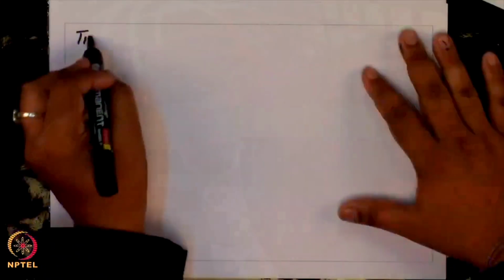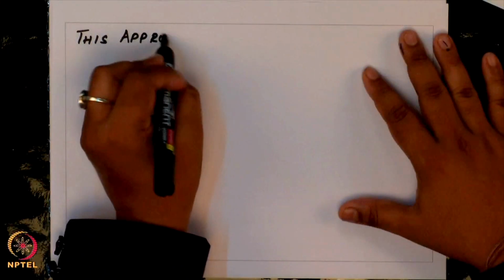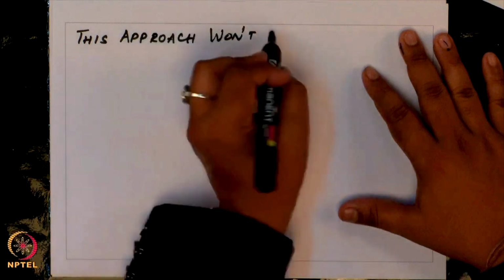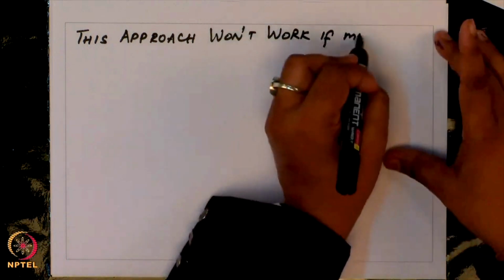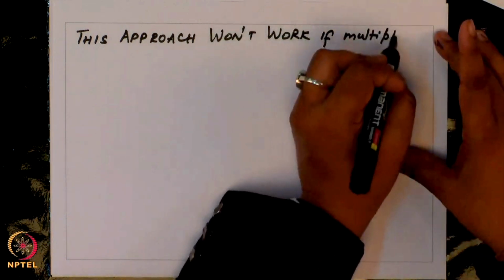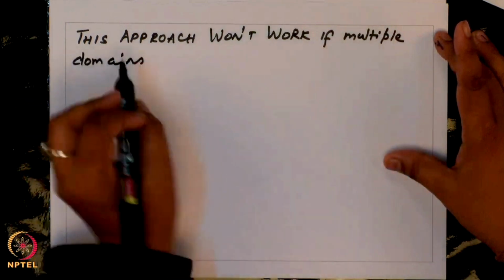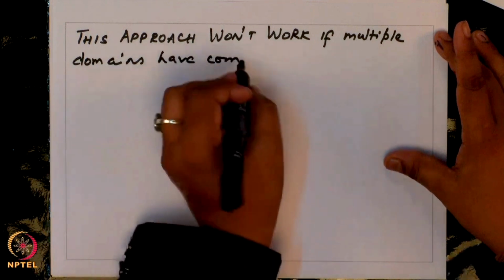However, this approach will not work if multiple domains have comparable lengths.